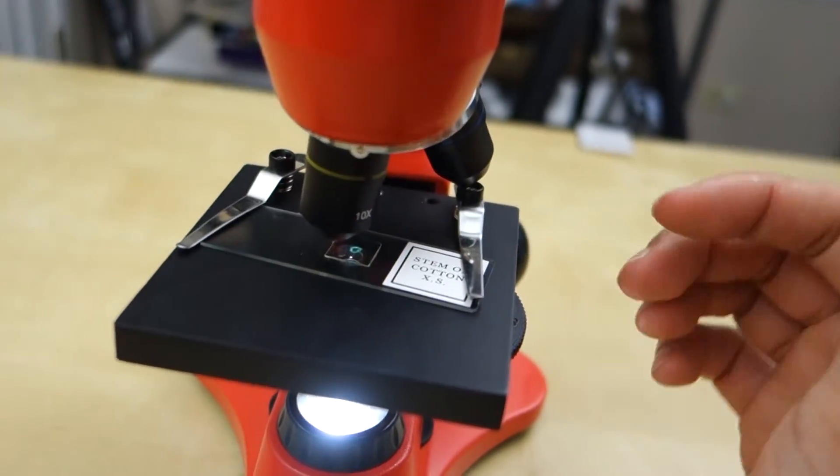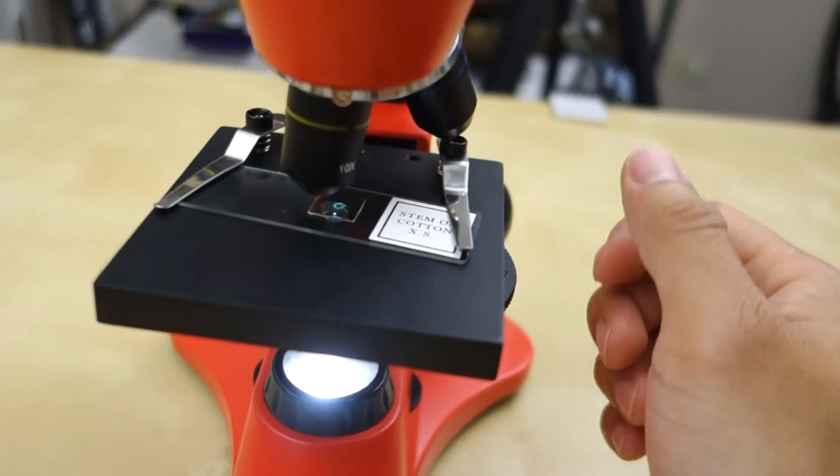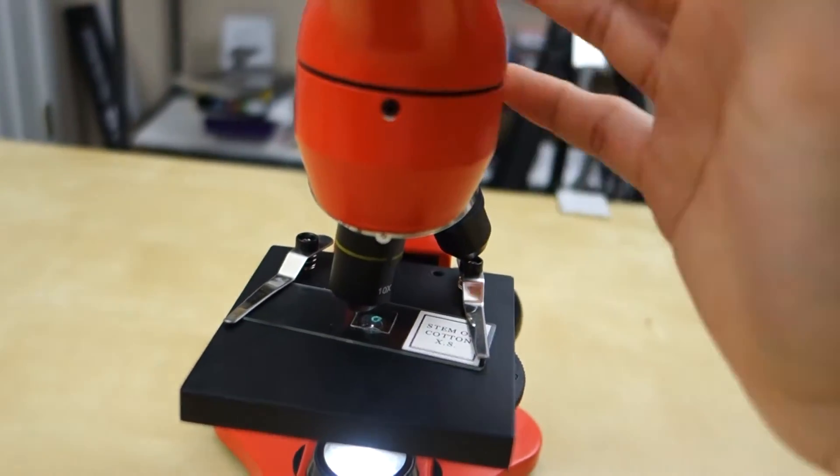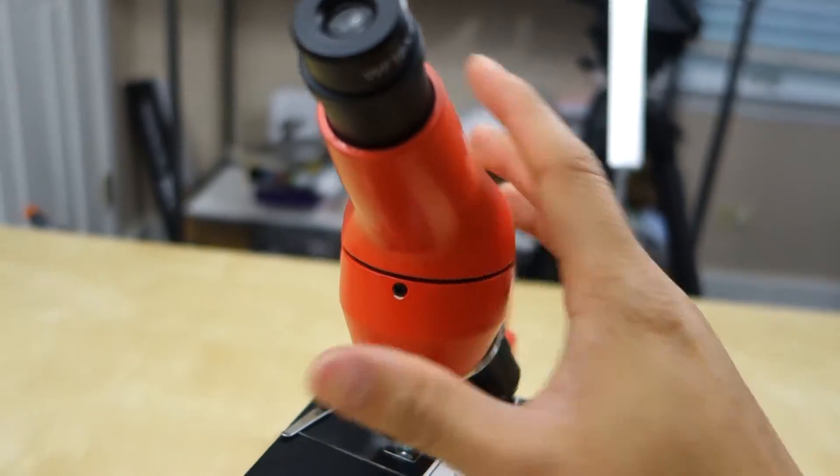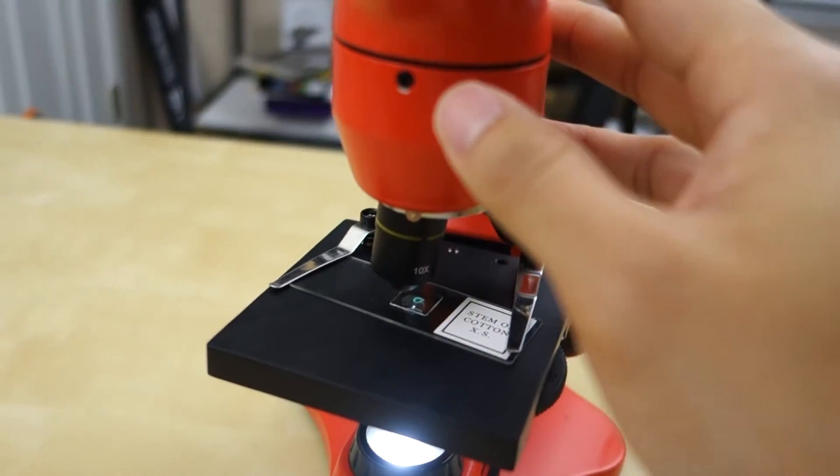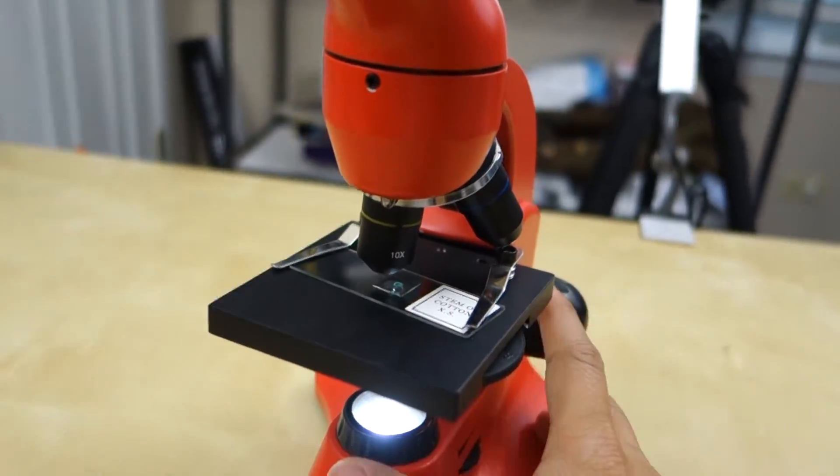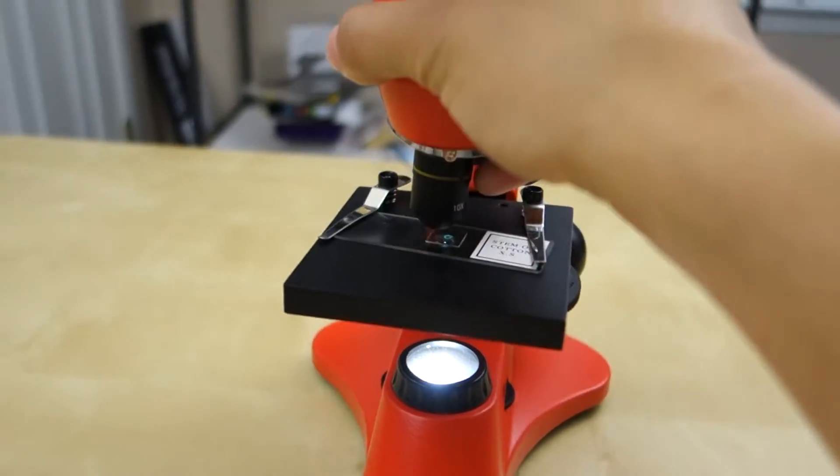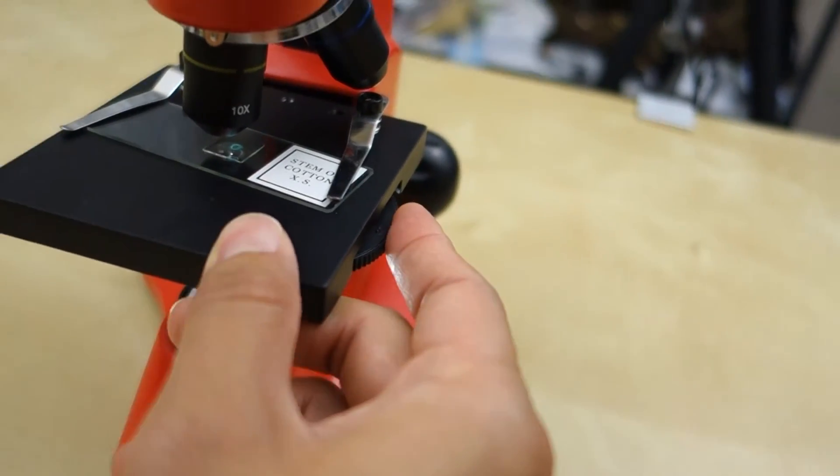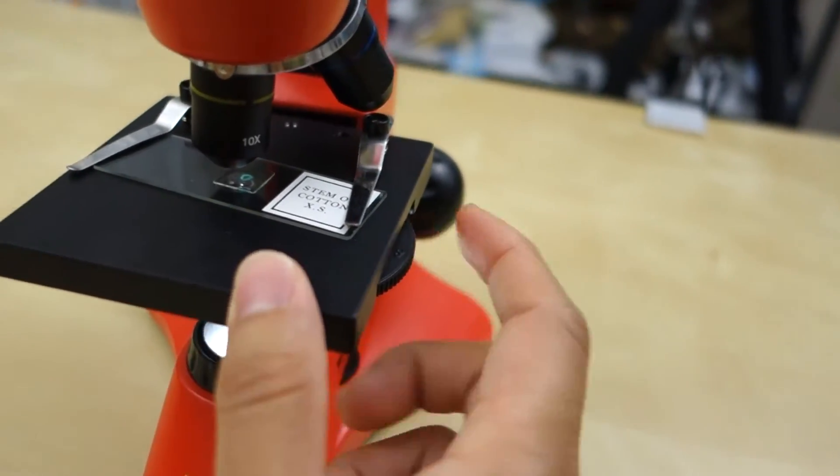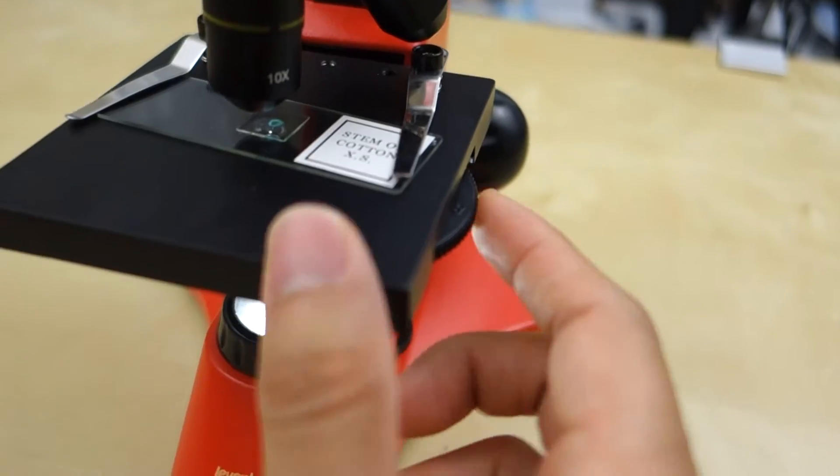So it's pretty interesting using this device to look at various different things. So from your fingernail or just dirt or one of these films. It's pretty cool. I always wanted a microscope. At school, I remember using a very nice lab quality microscope. So this is not going to be as good as that. But for home and educational purpose, I think this is pretty good. It's made out of plastic with a lot of metal parts in here in the middle. So one more thing I do want to point out is this adjustment here. You can actually adjust how big the size of the light hole is using this little knob right here.